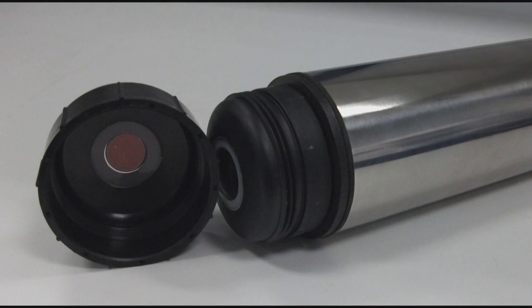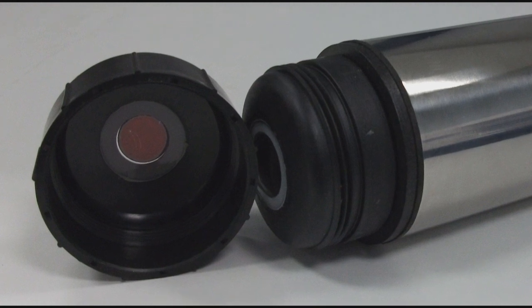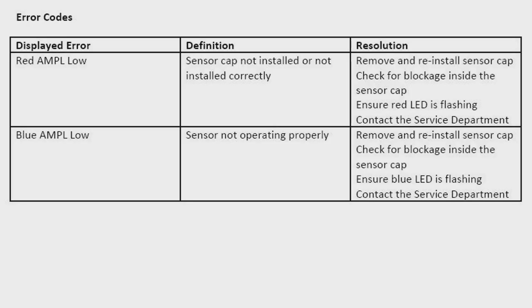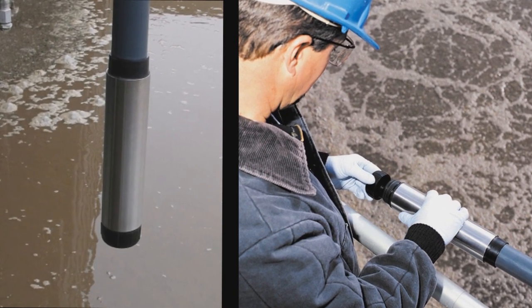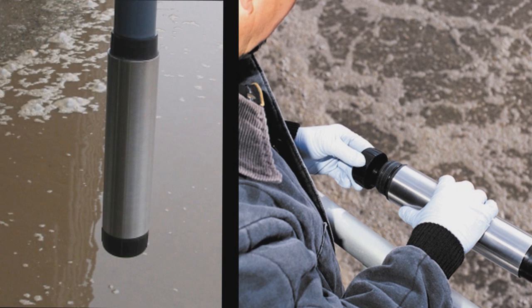In the majority of applications, your LDO cap will last for the defined two-year period. However, in some applications the LDO cap can wear quicker than normal. This will lead to a red amplitude low alarm appearing on your controller. If your sensor cap was previously working, this error message means that not enough light is being received by the photodiode in the probe, meaning there is not enough Lumafor on the cap to produce this light. This error should not occur until approximately 50% of the Lumafor is worn away from the cap. We advise you visually check the cap at this point to confirm the situation and, when confirmed, replace the cap.